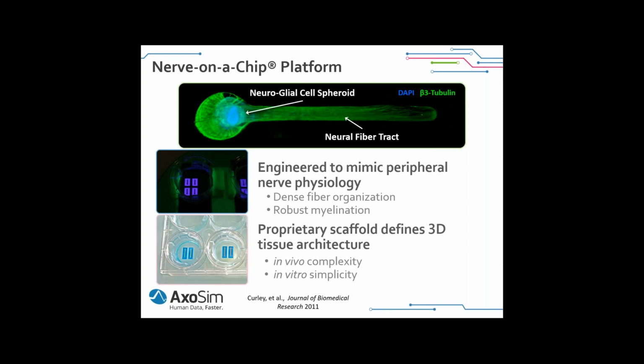these are untraditional cell culture inserts. So the way that you interact with these, the maintenance, the feeding, the assays, is quite similar, and it makes it, I think, a bit easier for us to translate.